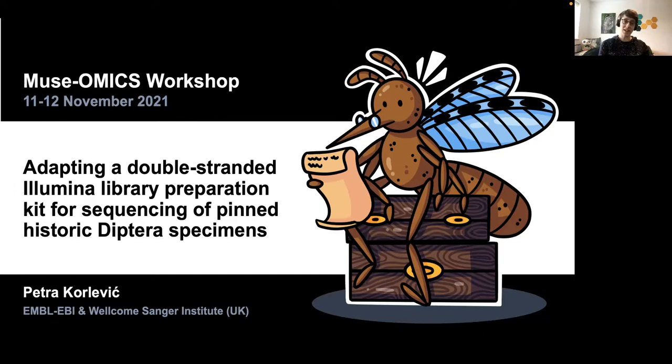My name is Petra, and I'm a postdoc at the Wellcome Genome campus here in Cambridge in the UK. And what I would like to talk to you about today is how we adapted a double-stranded Illumina library prep approach for sequencing of old pinned fly specimens.